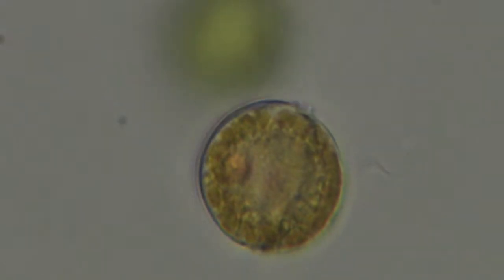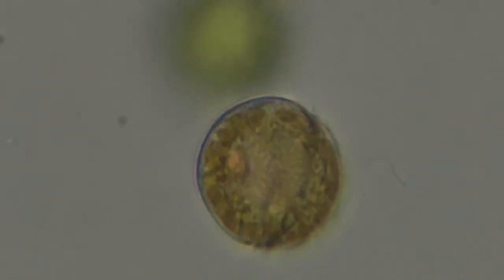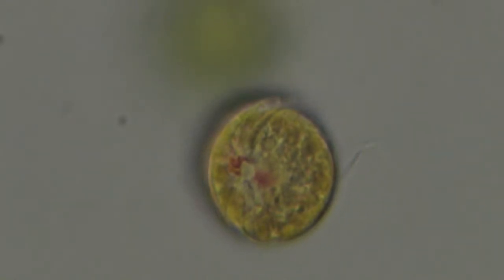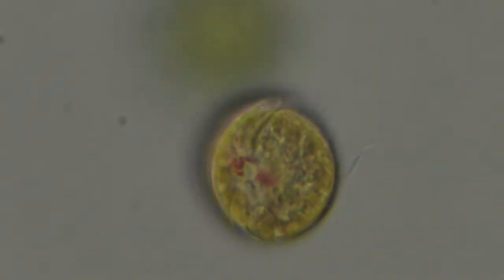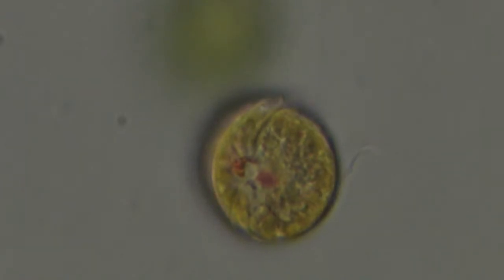Pretty cool. But yeah, these are the bad guys that make you sick and can kill you in mass numbers inside your shellfish. So when you see a red tide warning, it's a whole bunch of these guys. They're kind of a yellowish color, yellow-orange, and in mass numbers in the ocean, they look kind of reddish. The light hits it just right. I believe they can be more red than this too. But yeah, pretty cool stuff.